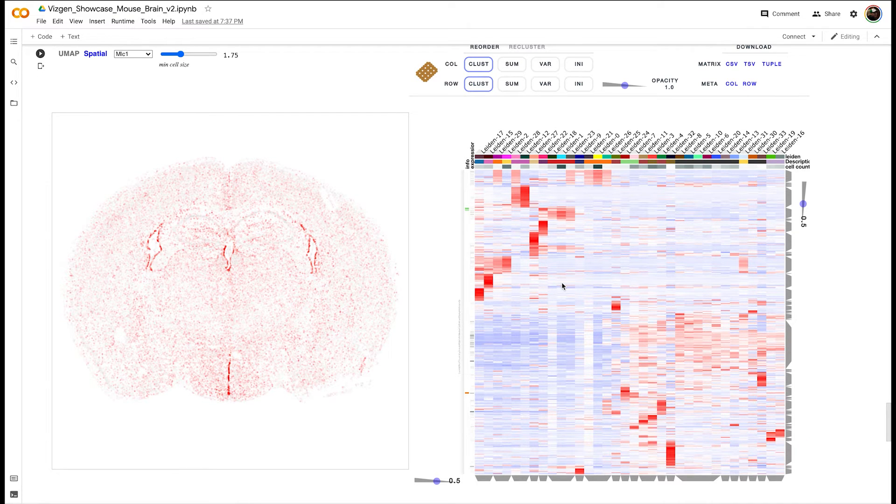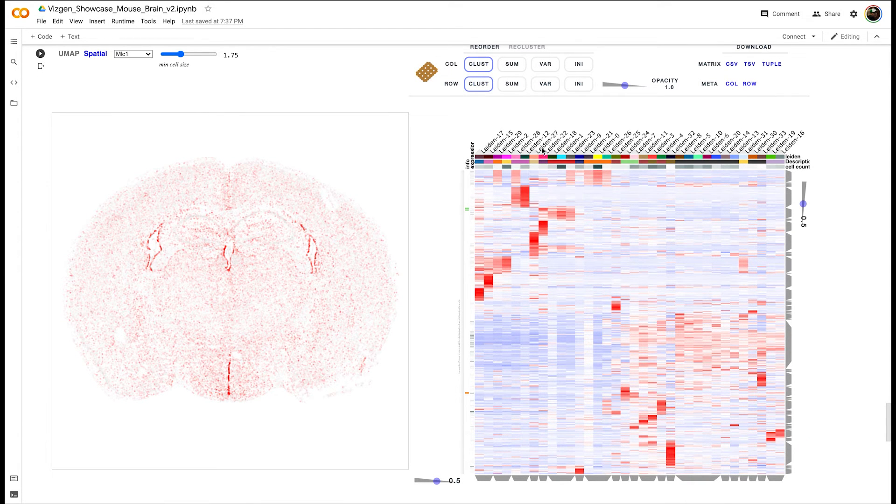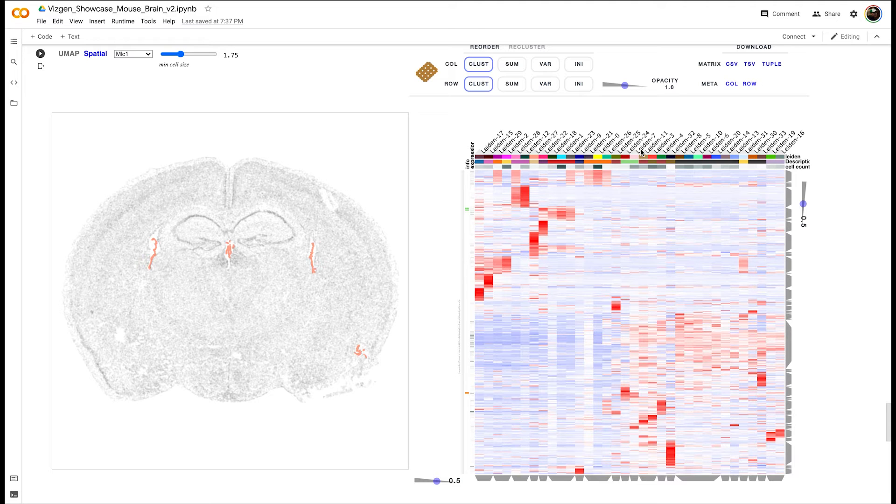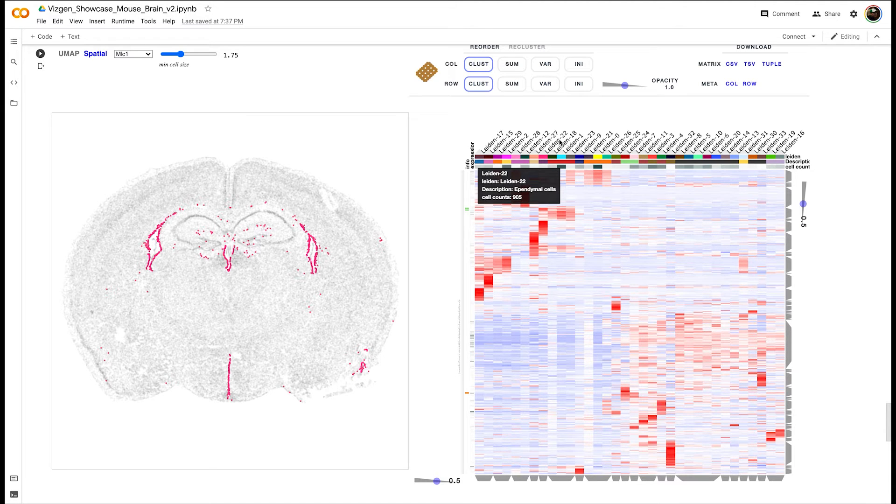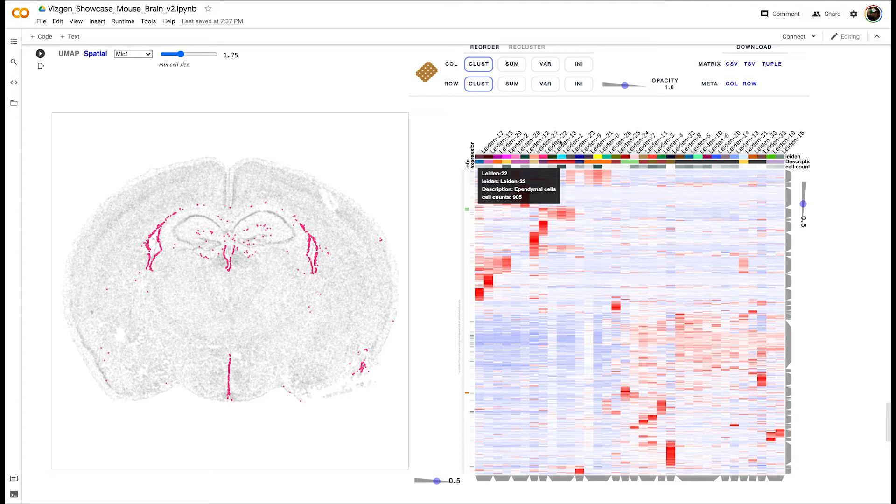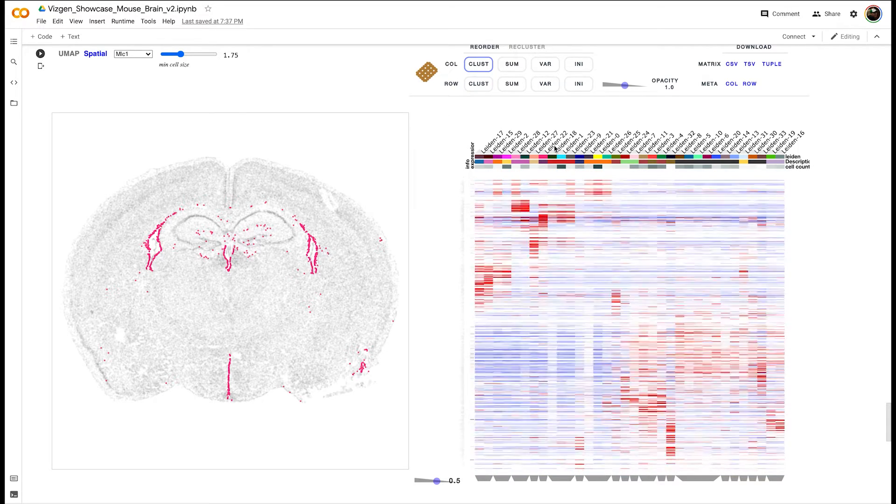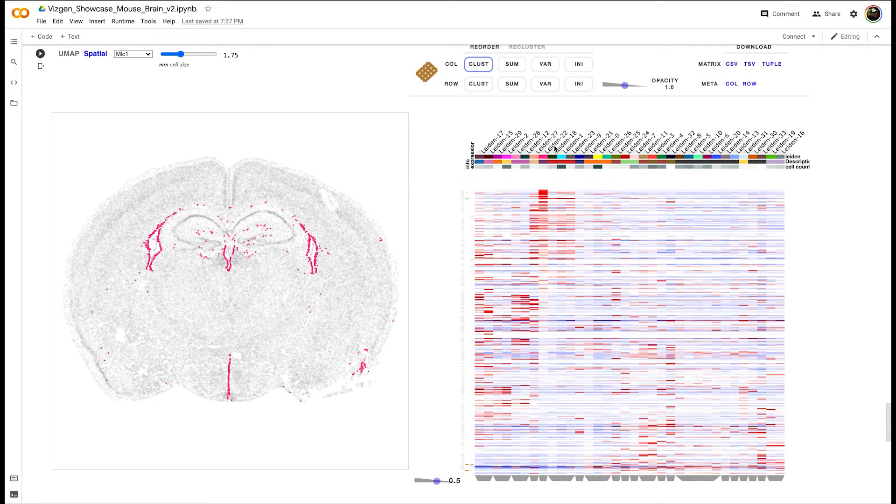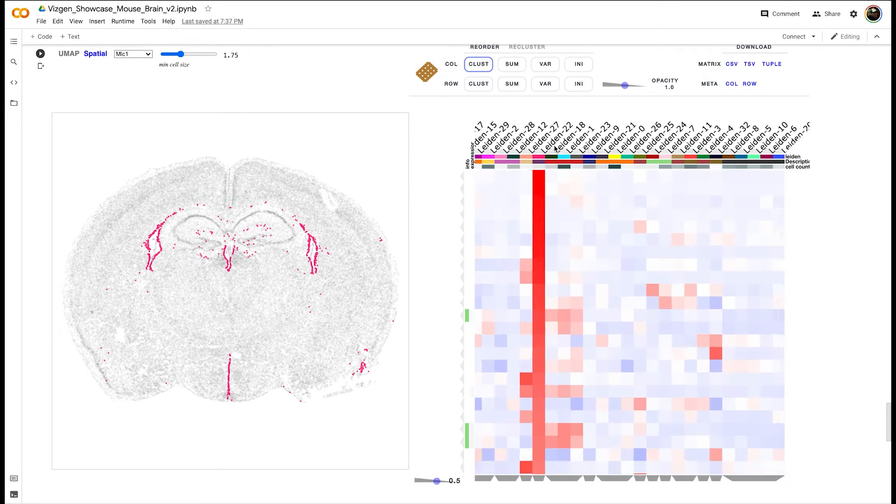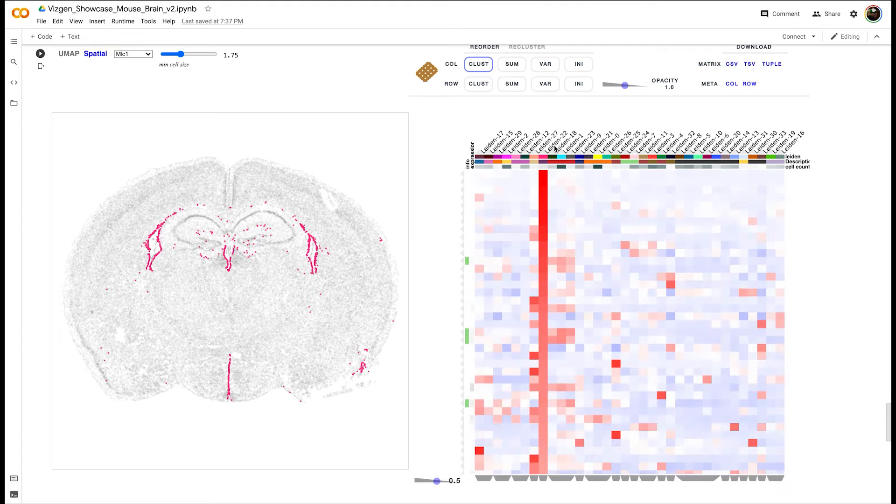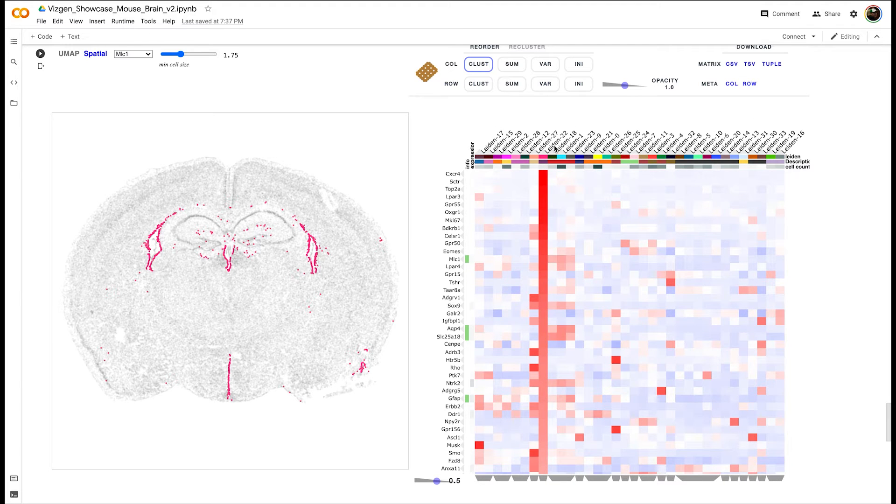We'll start off with cluster 22, which based on gene expression has been predicted to be ependymal cells, which are a subtype of a glial cell. If we double-click on cluster 22, we can reorder the genes that are highly expressed in this cluster.